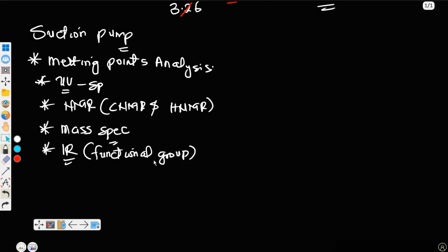Now, you may be asked physicochemical parameters. When we talk about the physicochemical parameters, we are talking about parameters such as solubility, density, melting point, boiling point, refractive index. All right, all these ones are some physicochemical parameters.